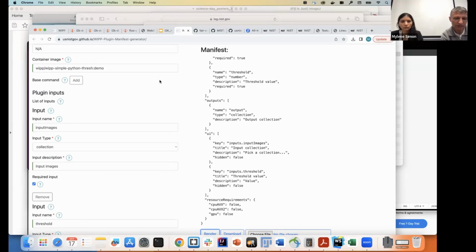We have also invested quite a bit of time in Deep Zoom into making sure that people can download chunks of data. So you don't have to download terabytes of data. You might just be interested in some subset of cells. So you can go and download any specific colony or a subregion, channels, and so forth. So that's another thing from a reproducibility and reusability perspective, so you can build on top of someone else's research, these tools should be available.